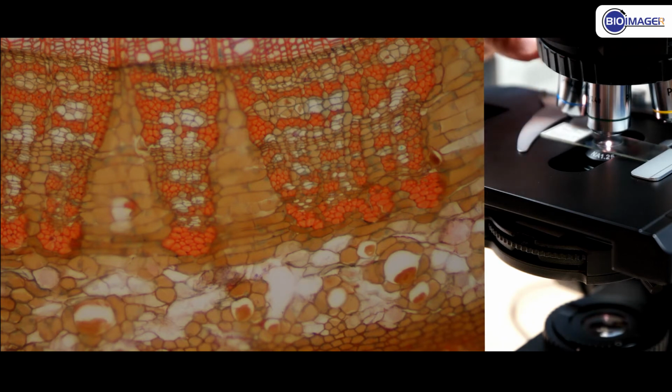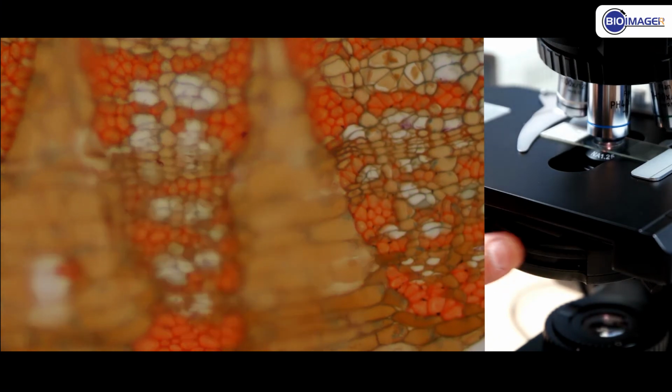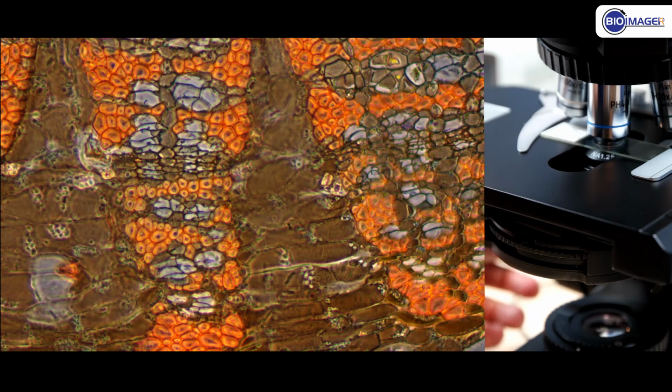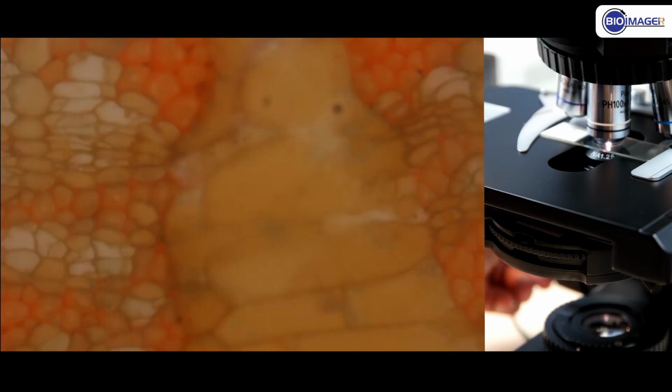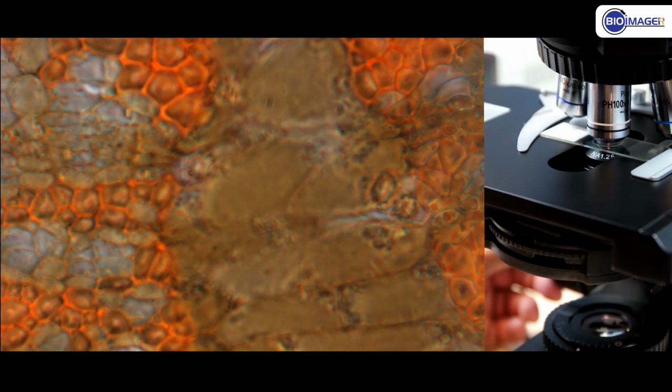Next we switch to 40x objective lens, and the image we see here is in bright field mode. And from the condenser we switch to 40x, and you can see the difference. Now we switch to 100x, so I like to start from bright field. Obviously the image will not be in a good sharp focus because the objective lens is supposed to be used with oil, and in this short demonstration I'm not going to add oil. So we look at this in phase contrast, and the image is not that bad, you can see.